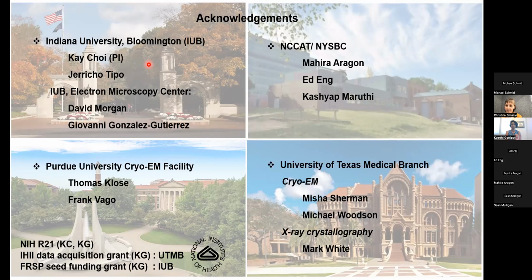Again, all of these methods did work, but they were not consistently working when we tried. What did work definitely was the protein, the Fab coating.